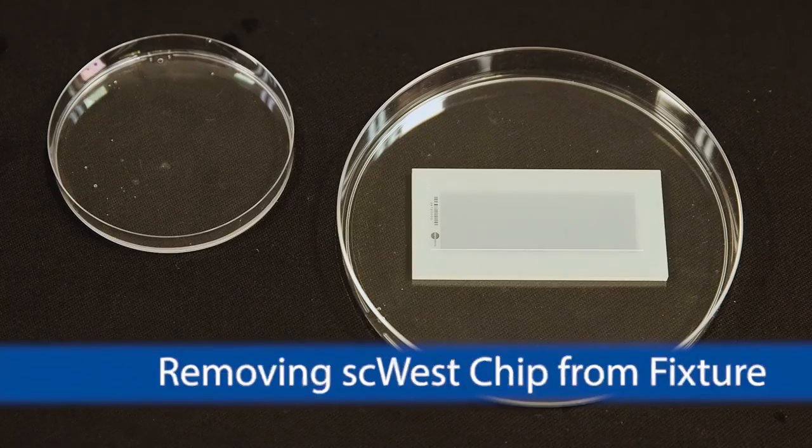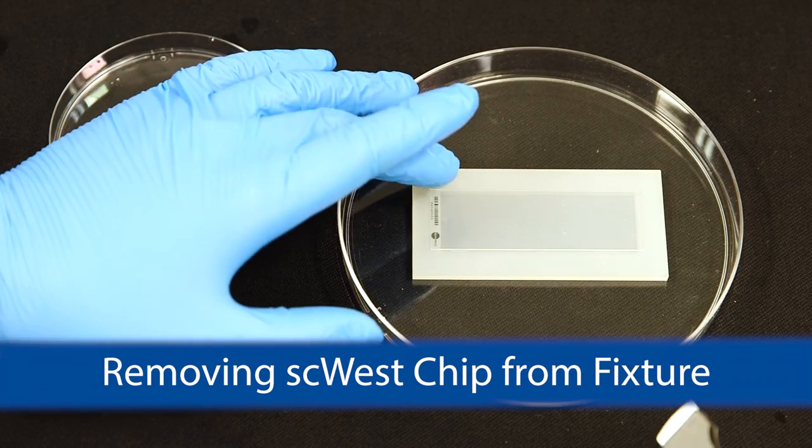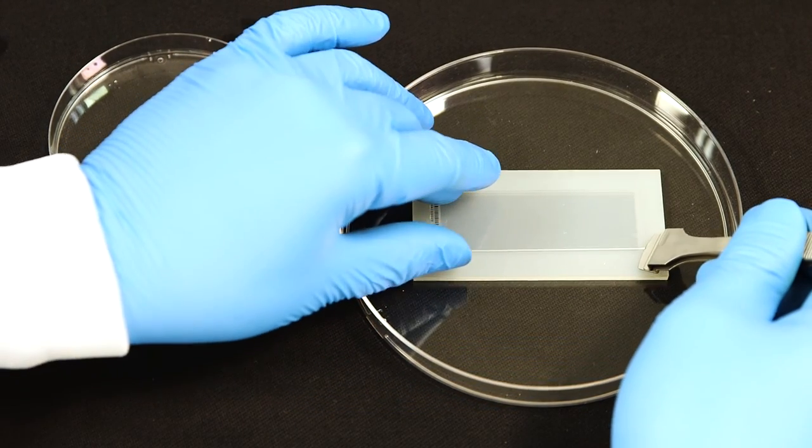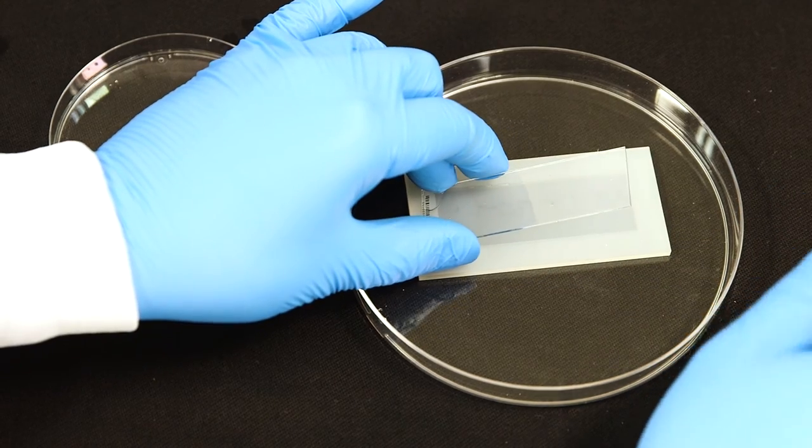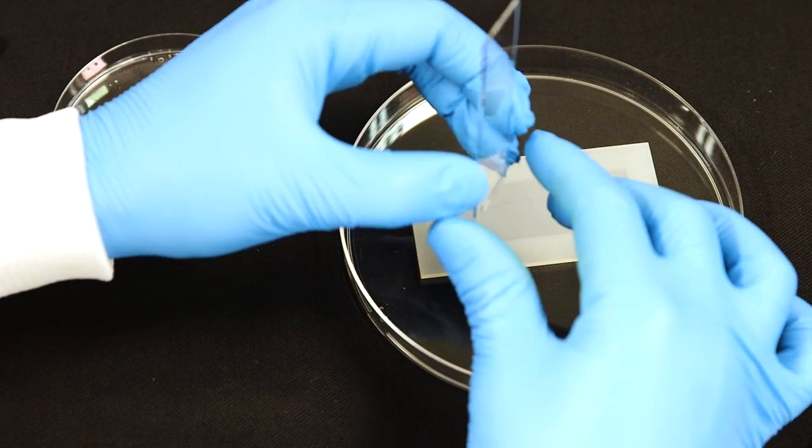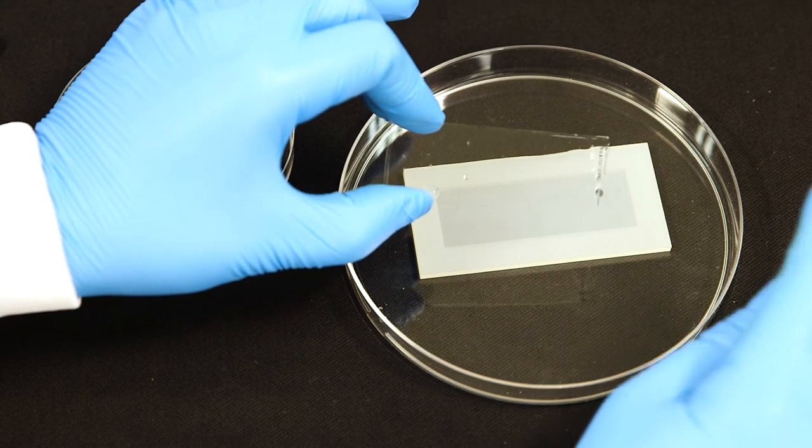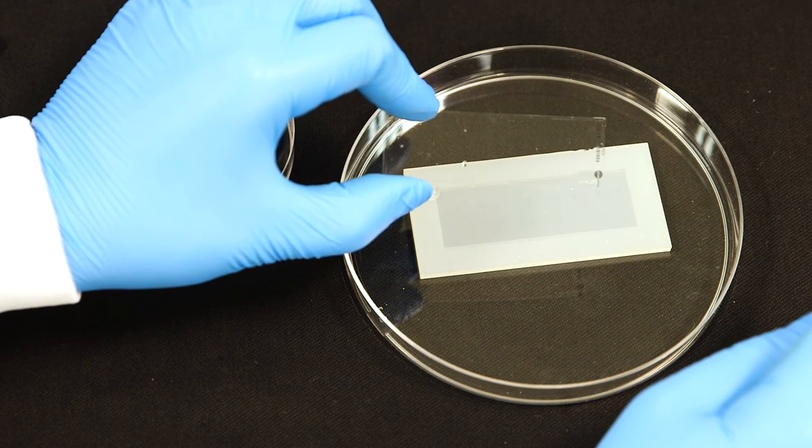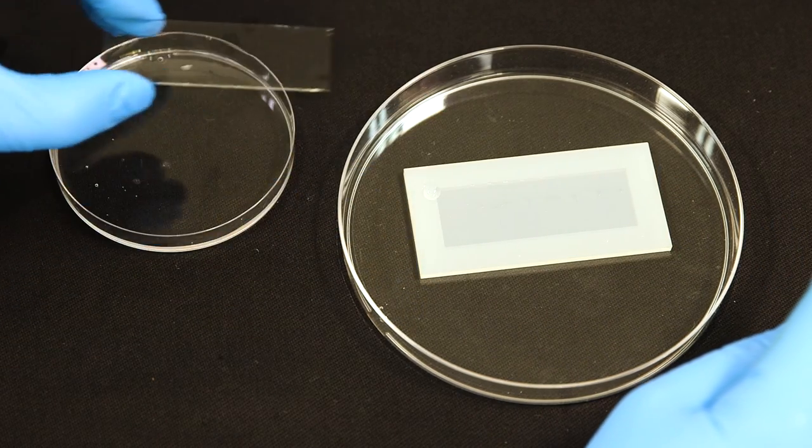To remove the SC-West chip from the probing fixture, use your finger to apply pressure to one corner of the chip and gently pry up the opposite corner of the chip with the tweezers. Be careful not to damage either the gel or the probing fixture with the tweezers.